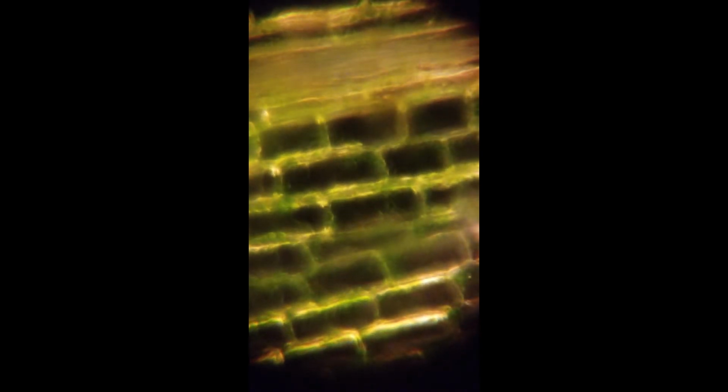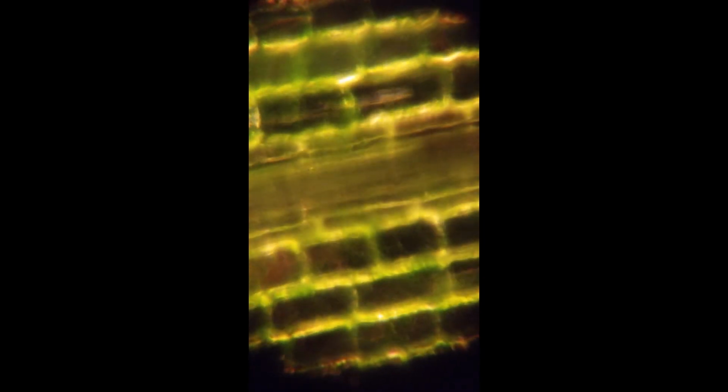Now see, it's a little more difficult now to see those chloroplasts moving around in their cells, in part because the depth of field is different with Darkfield. In other words, I can't get the whole cell, or at least all the chloroplasts, in focus at once. So it's a little tougher to use Darkfield. There we go.